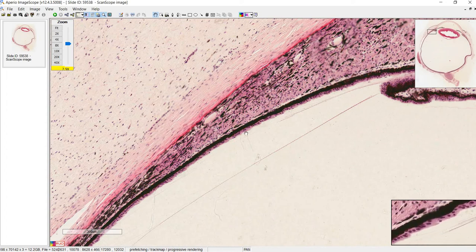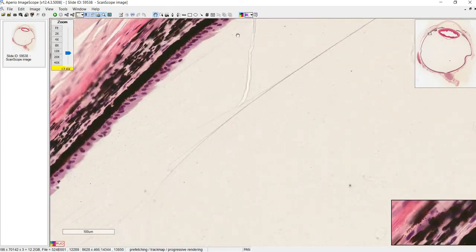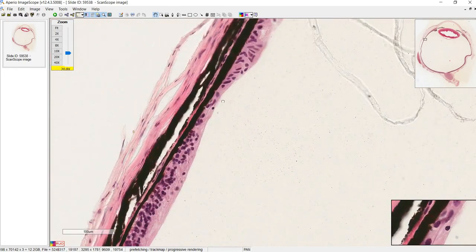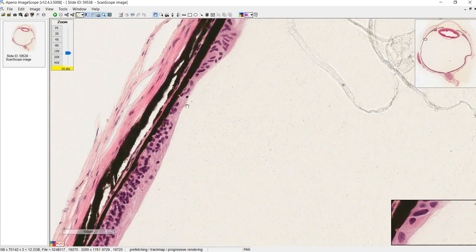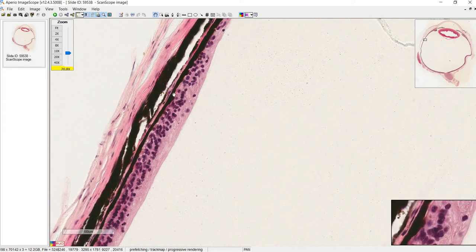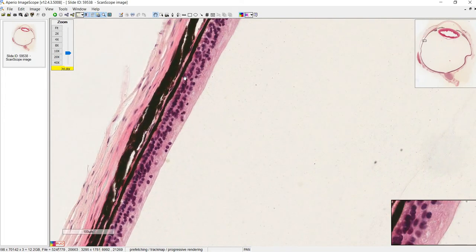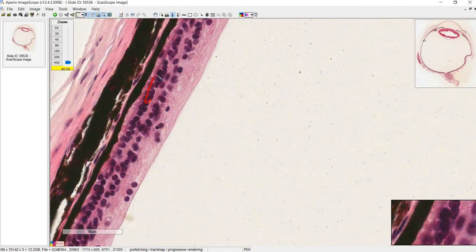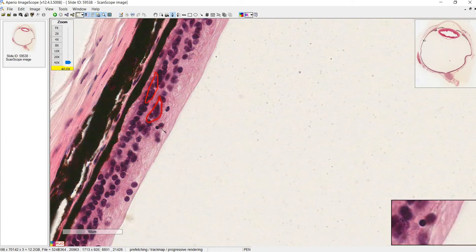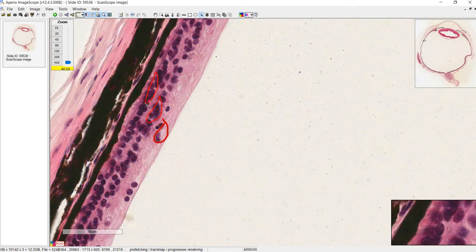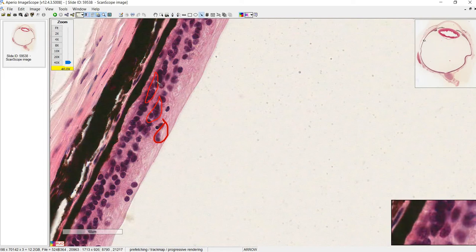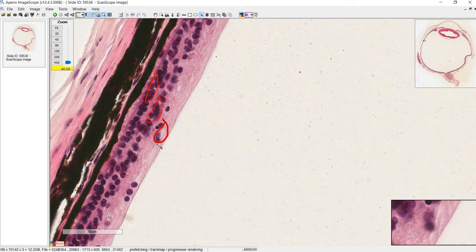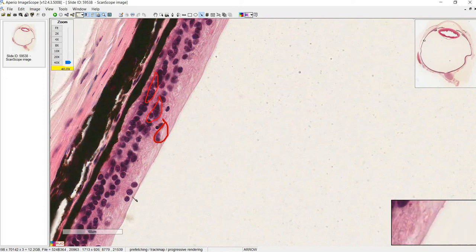The part of the ciliary body that tapers off as you move posteriorly is the pars plana. If we trace the ciliary epithelium back, we get to a point called the ora serrata — right here — which is the transition point where the retina begins. At this point you can see it starts building up three layers of nuclei: the outer nuclear layer, the inner nuclear layer, and the ganglion cell layer. The ganglion cell layer is what sends axons into the optic nerve.